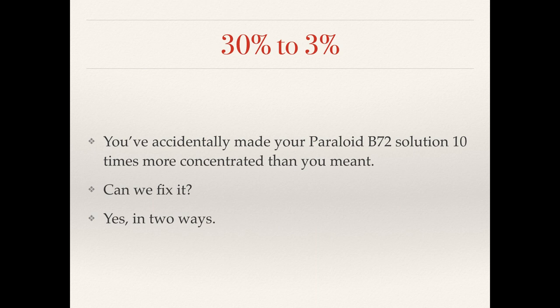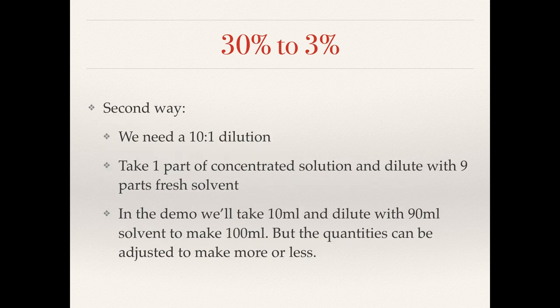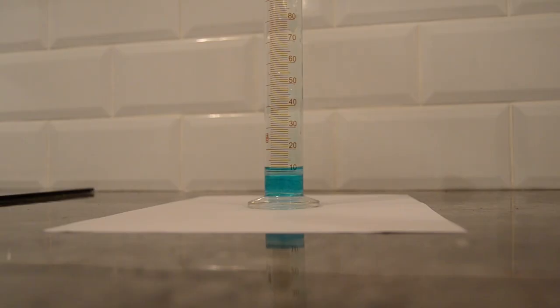This example came from somebody in the studio who made a solution of Paraloid B72 at 30 percent instead of the 3 percent they intended to make. Congratulations for getting that much to dissolve — that really must have taken some work. Can we fix this? Yes, there are two ways. The first is to evaporate off the solvent — the dry Paraloid will be stuck inside the container, you can remove it, measure out the correct amount, and redissolve. The second, more practical way is a 10 to 1 dilution: take one part of the concentrated solution and dilute it with nine parts fresh solvent.